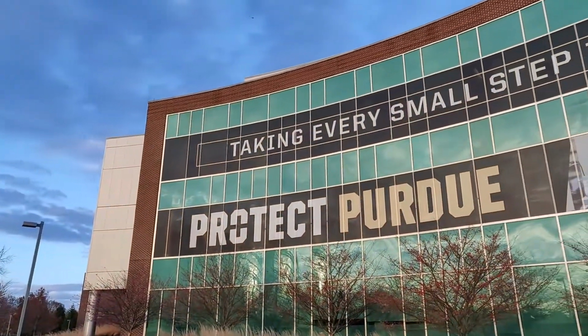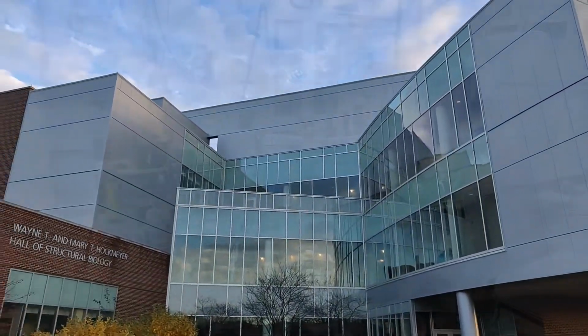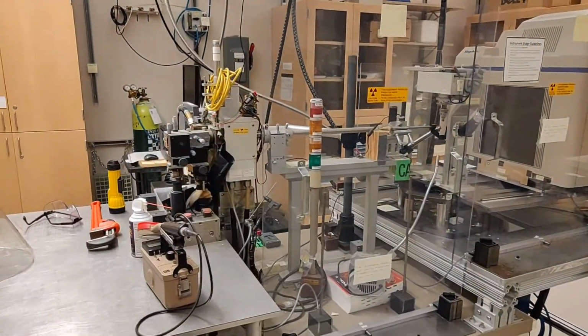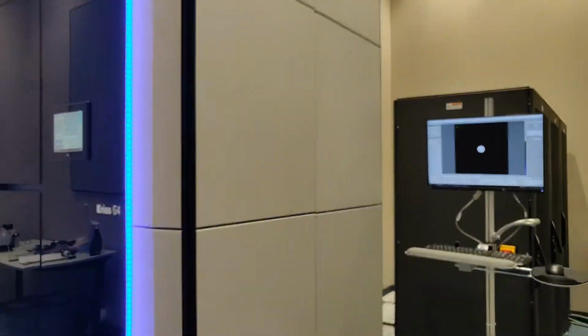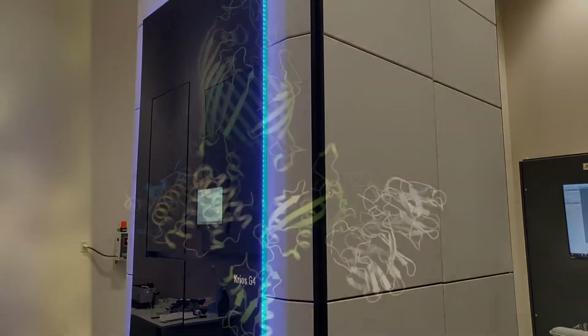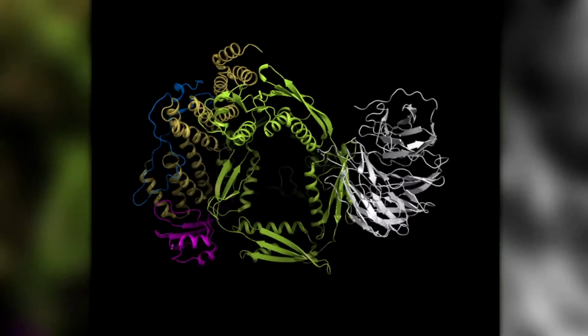At Purdue University, the Hockmeyer Hall of Structural Biology is well equipped to conduct X-ray crystallography and cryo-electron microscopy, two key techniques that can reveal the atomic structure of biomolecules. Let's look at how we do it. It all starts with the identification of a target molecule.